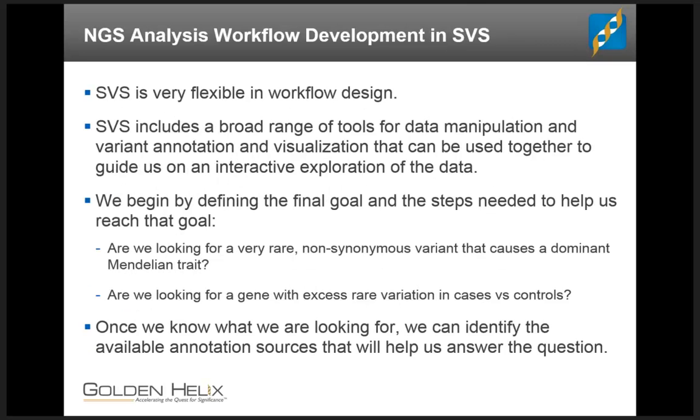Now, within SVS, I want to emphasize that SVS is very flexible in workflow design. It's not a black box in any way. It's really a platform that has a wide range of tools that can be used for data manipulation, variant annotation, variant filtering, calculating association tests. And as long as we know what it is we're looking for, we should be able to construct a workflow using the existing tools that will get us to that final goal.